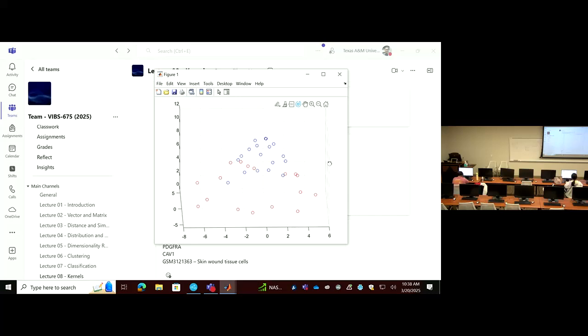Yeah, just like that. Not yet. Yeah, you change the color after you finish the red points, right? By clicking this. Okay, now start to click blue ones in the middle. Then once you finish, you click the right button to stop.